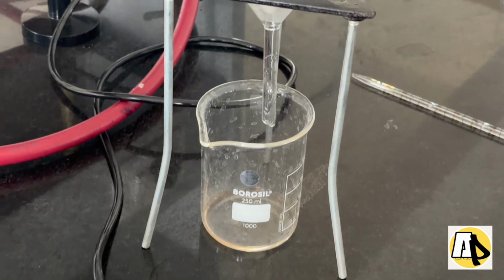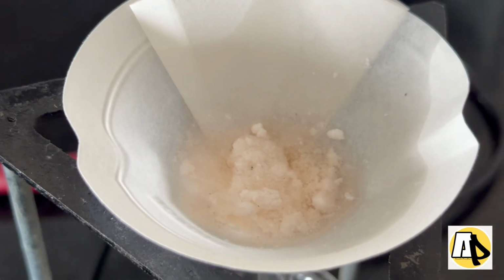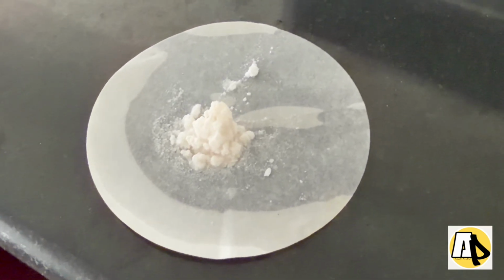So you can see the filtration happening here, and this is how the salicylic acid looks after filtration.